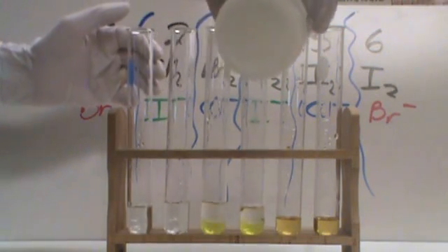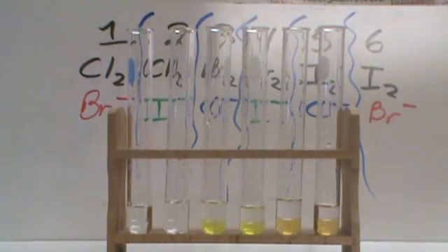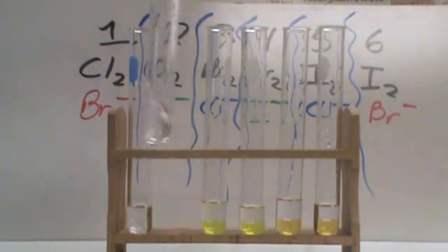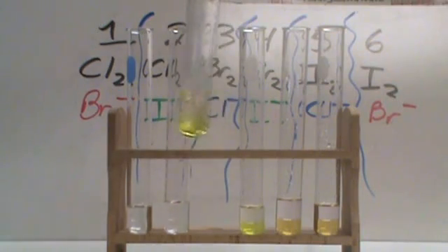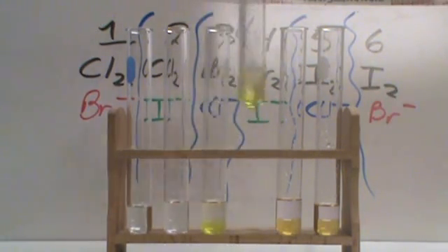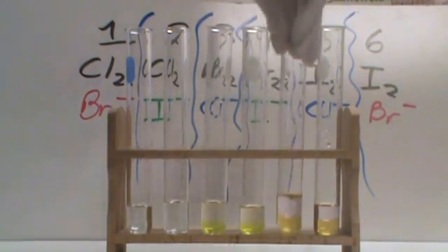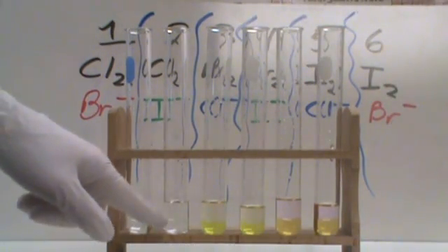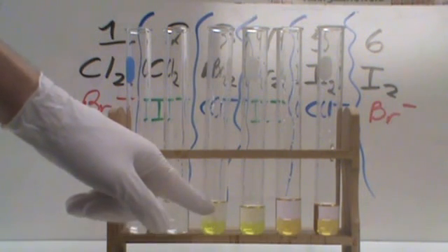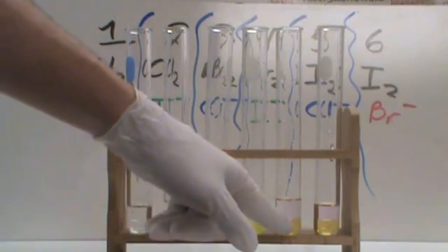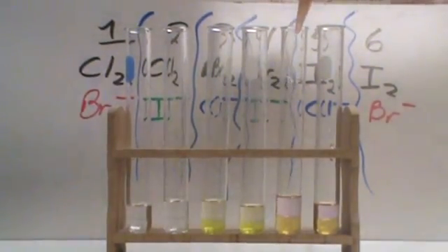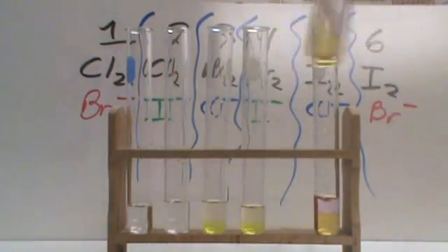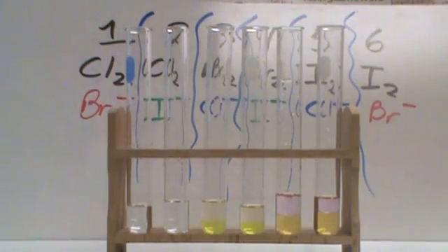Of course I'm wearing gloves because hexane is carcinogenic. As we swirl these around and mix them, the halogens are going to tend to interact better with the hexane. We're going to see some of these change a little bit in their appearance. First of all, the chlorine is clear in both. The bromine is yellow on the bottom and kind of a faint orange on the top. The iodine is kind of brown in the aqueous layer and the top hexane layer is actually kind of purplish. This is our starting point.